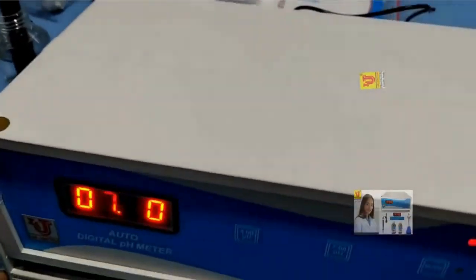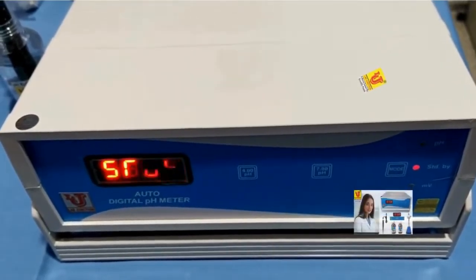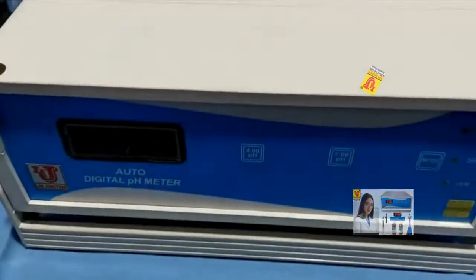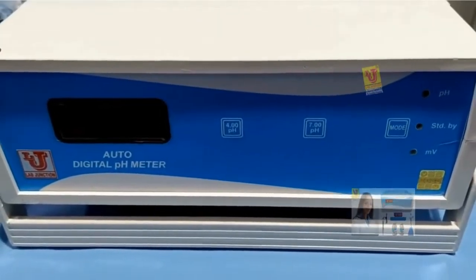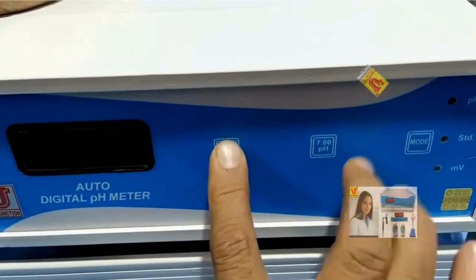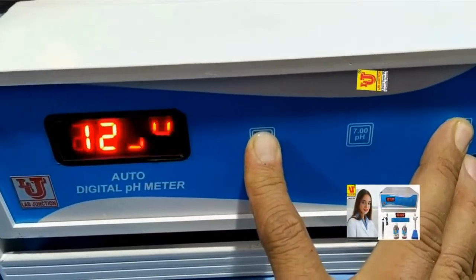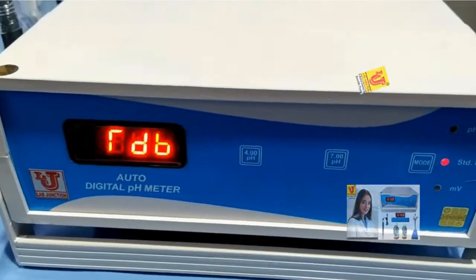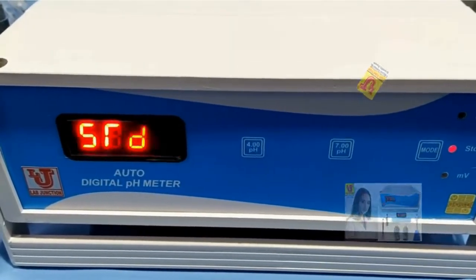Now I am going to standby. Sometimes the instrument shows an error. In that condition, you have to switch off the machine and reset the instrument. To reset, press the 4 key and mode key both simultaneously, and while pressing both keys, switch on the machine. The instrument shows 1, 2, 3, 4 — reset is done. Release the keys. Your instrument is reset. Now again calibrate your pH meter and check your results.